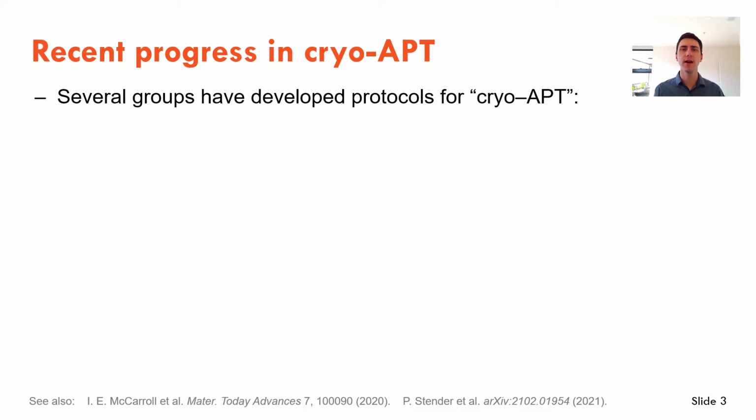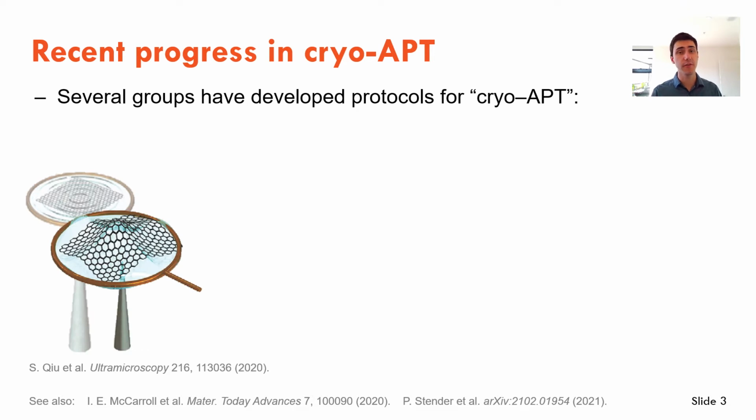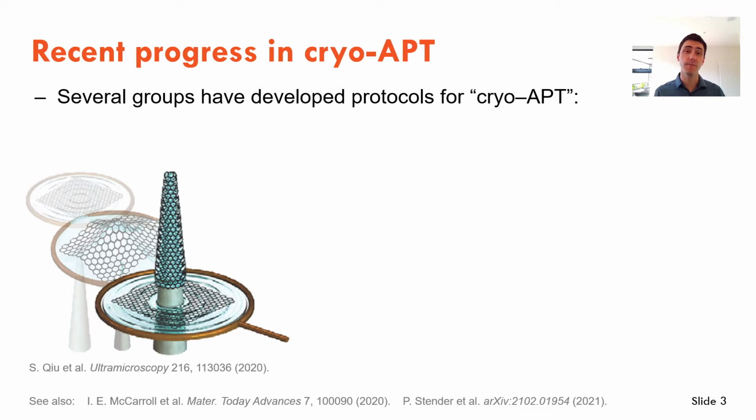Collectively, the methods for analyzing soft matter fall under cryo-APT, protocols and procedures for the cryogenic preparation of samples and their cryogenic transfer into the atom probe microscope. Several groups have made advances in this area recently. The groups at Deakin and Monash universities in Victoria have been using graphene to encapsulate liquids. A pre-sharpened tip is lifted through an eyelet holding the analyte solution with a graphene layer floating on top.